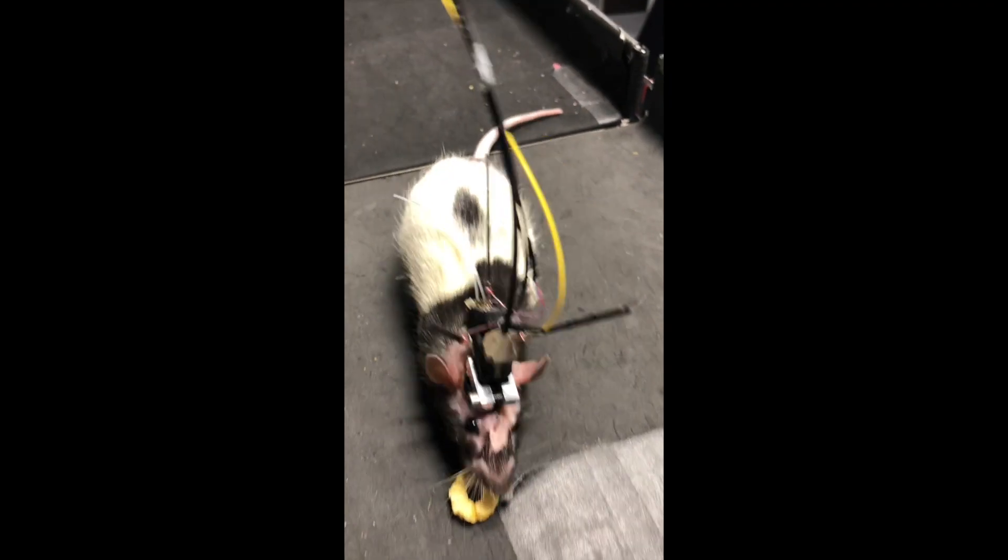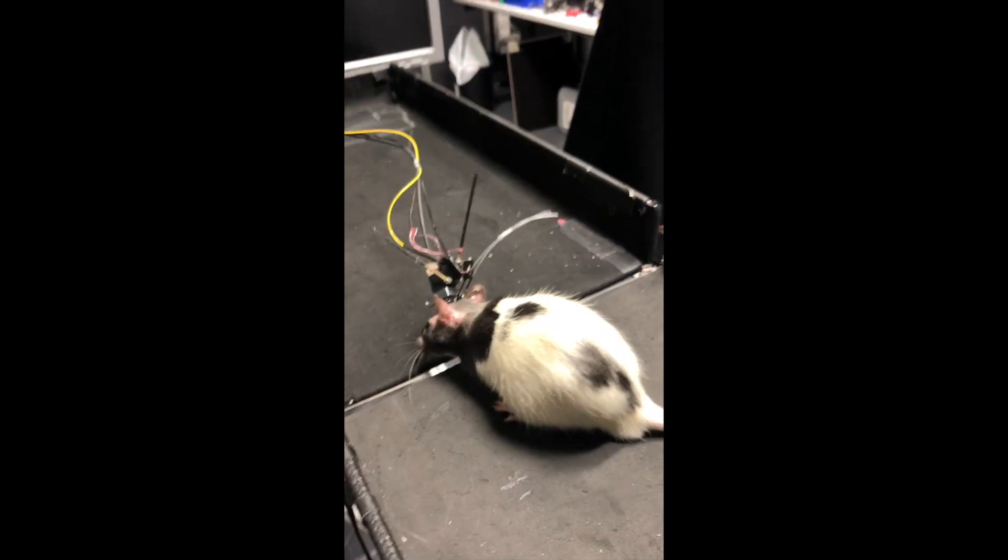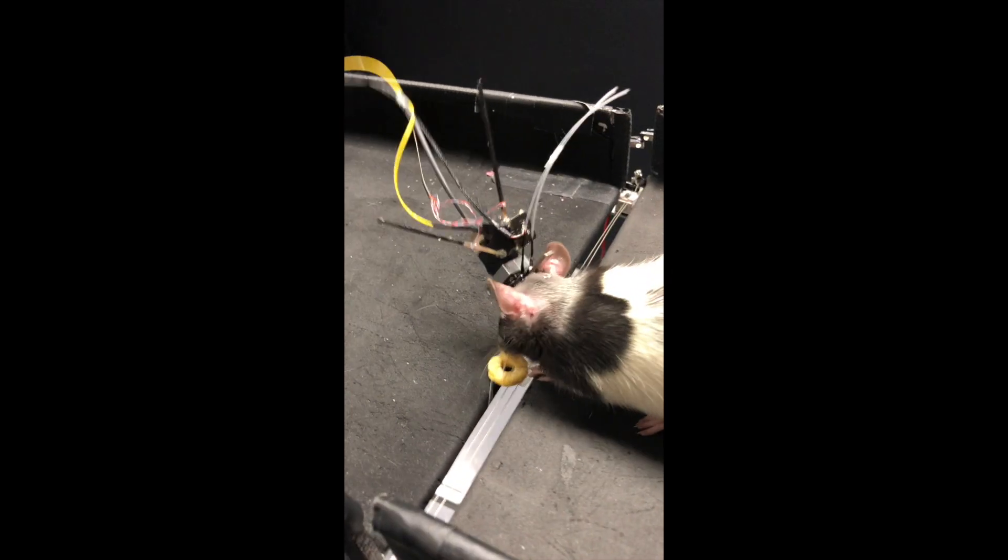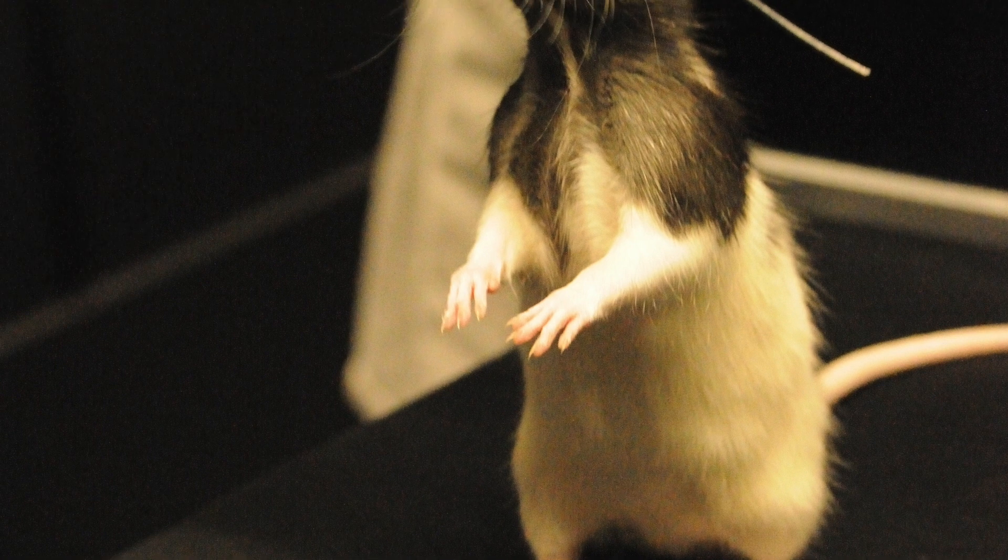In collaboration with Philip Russell's group at the Max Planck Institute for the Science of Light, the group of Jason Kerr now developed a small head-mounted three-photon microscope capable of imaging all cortical layers in a freely moving rat.